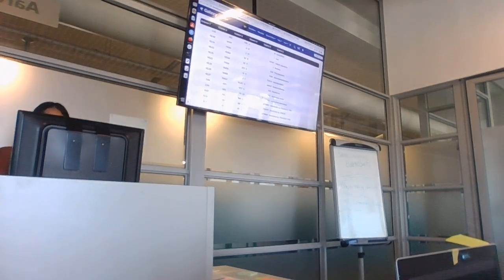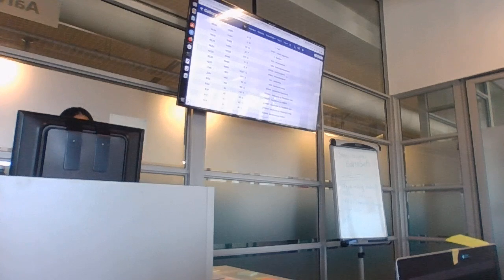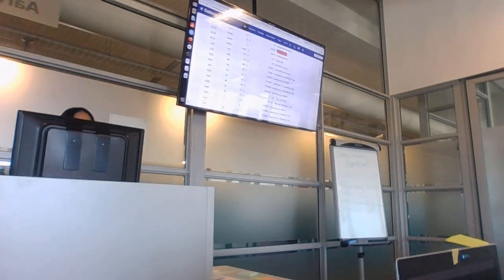Okay. So, thank you. You can see that it's trying to classify what it is, but if you look at it carefully, you see that, has anybody worked with cholera before? Yeah? Okay.